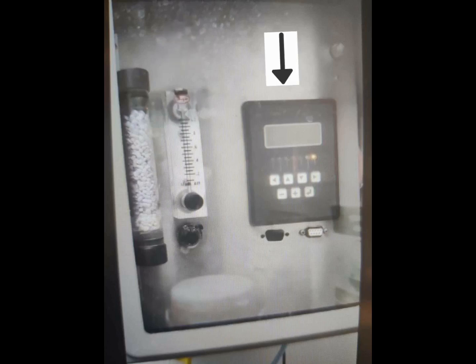Finally, the pad on the right is used to modify other auxiliary settings of the system from outside the chamber, as you can see from the various buttons and outlets surrounding it.